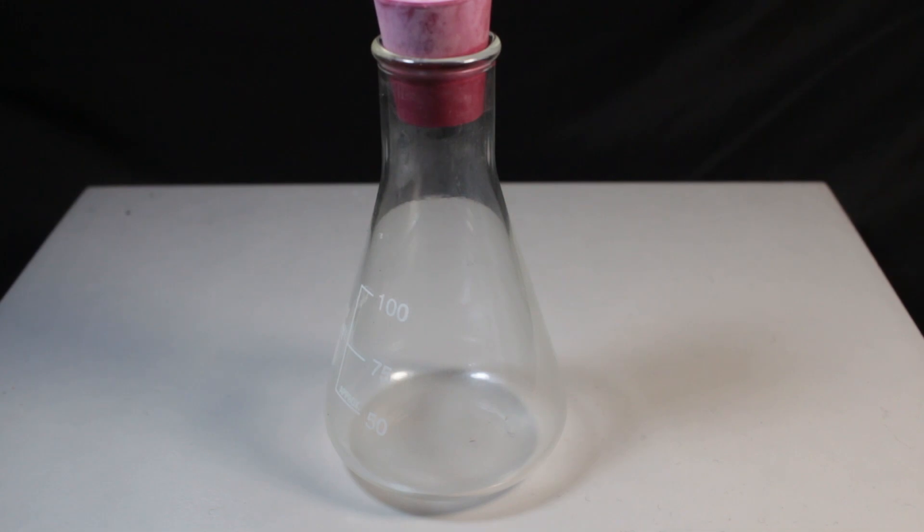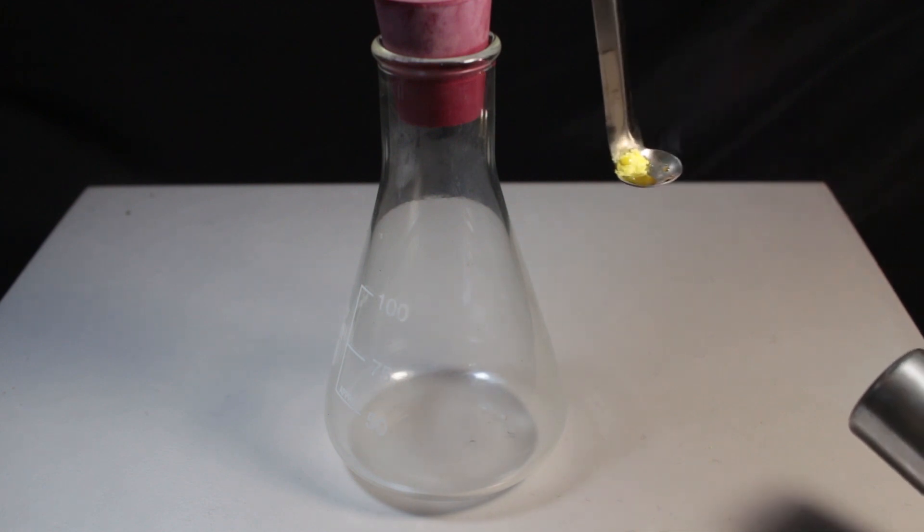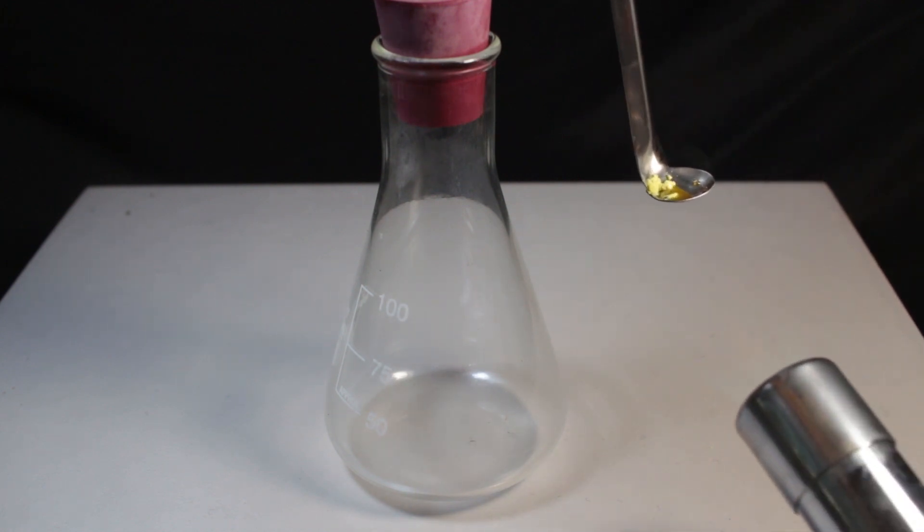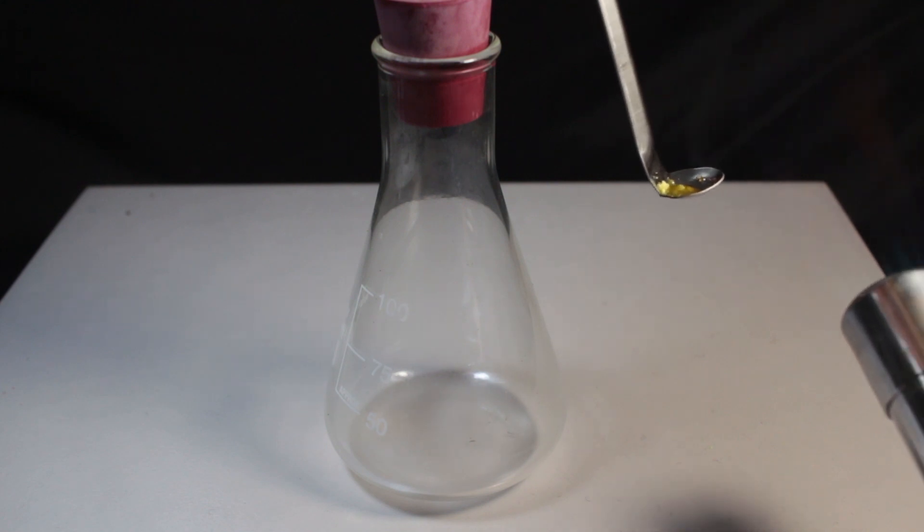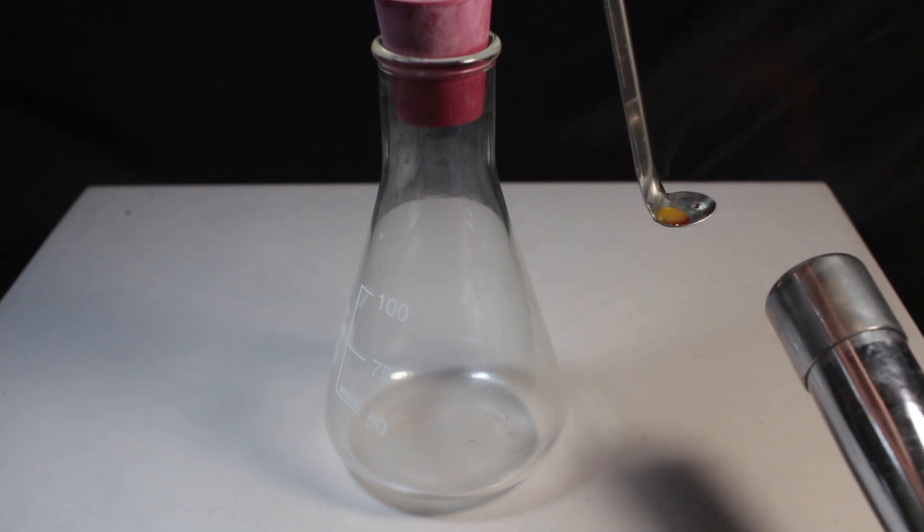Here I have conical flask filled with oxygen and here is sulfur, yellow powder, which melts at pretty low melting point. You see it easily turns into clear liquid, which fast turns brown, deep brown and virtually black.